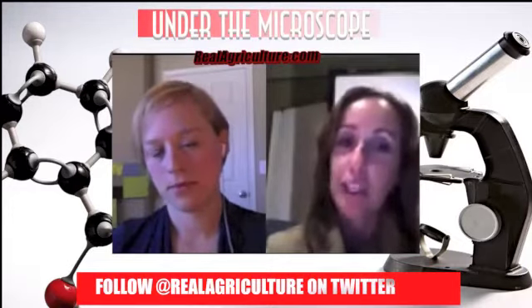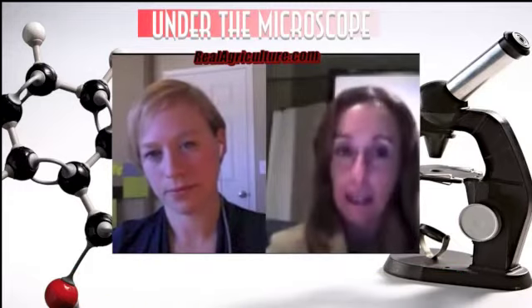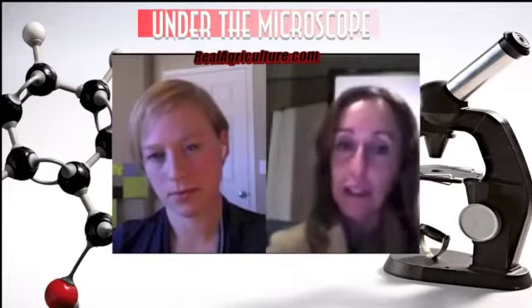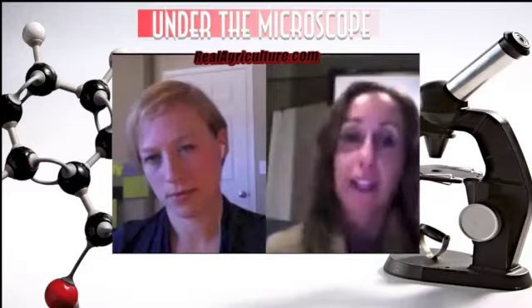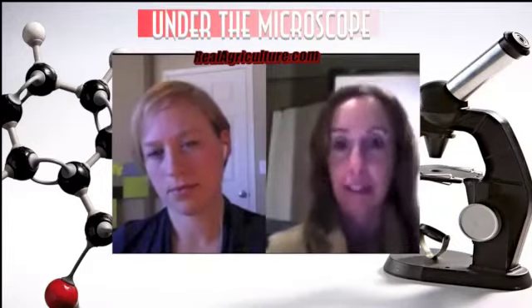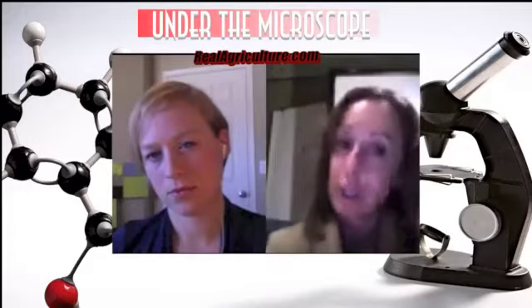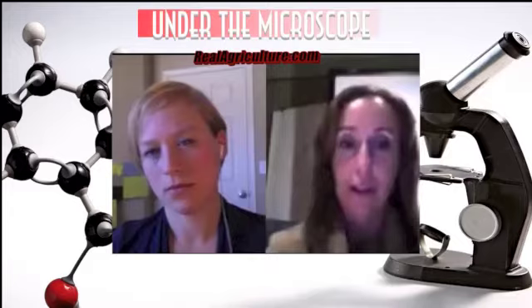Now, the first thing to do is a germination test. Find out how many plants are actually going to grow and produce a viable plant. The germination of a pea that is 95% versus a 75% can significantly impact what the stand is going to look like, and at the very end, the yield. So that would be a 20% reduction in plants. So obviously the germination is the first thing. Find out how much grows.